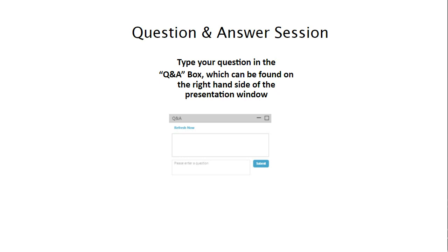So we've found some limited utility in it. Quite frankly, I never use it on my Orbitraps, for example, because getting rid of TFA is a bit of a chore. So we tend to just use DFA instead.